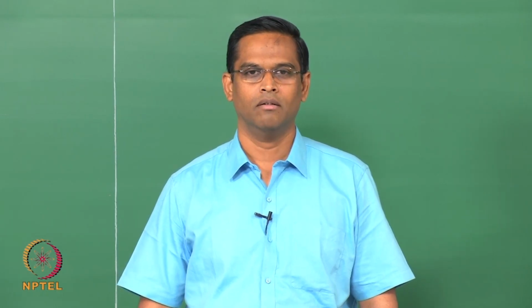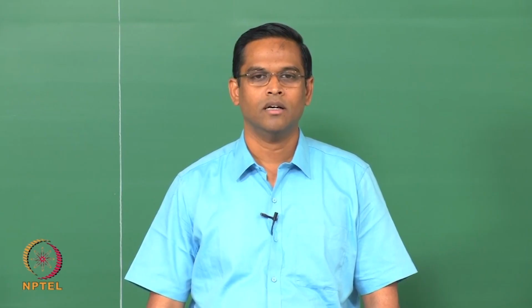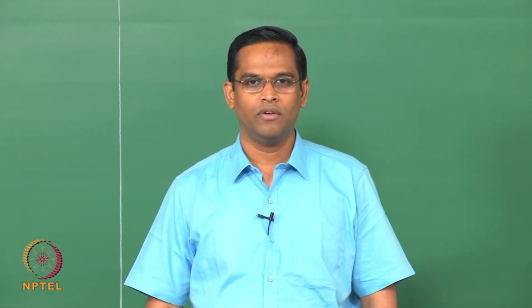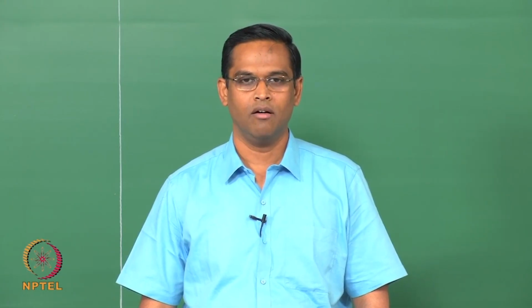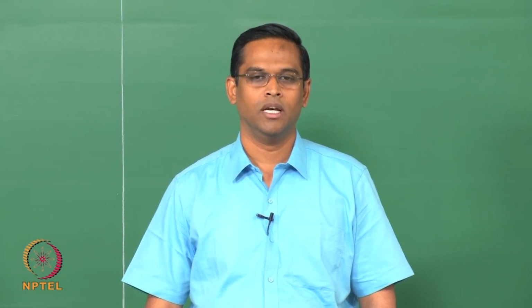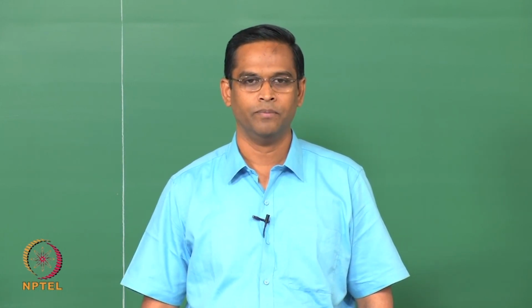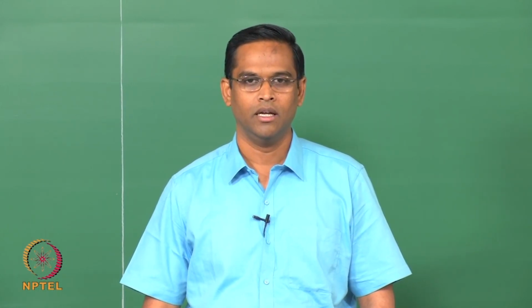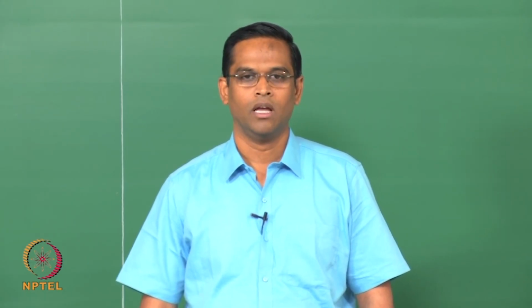Hello everyone, welcome to this material characterization course. In the last class, we looked at the effect of crystallite size on the peak intensity of X-ray diffraction. Similarly, we also looked at the effect of strain on the X-ray intensity peak after diffraction.